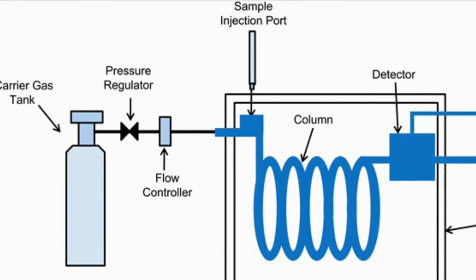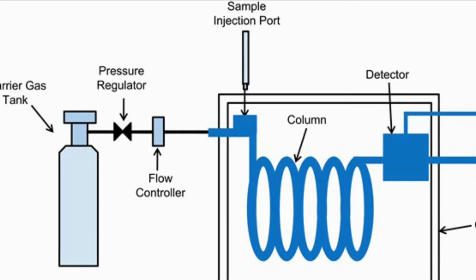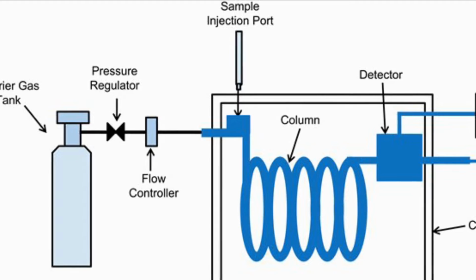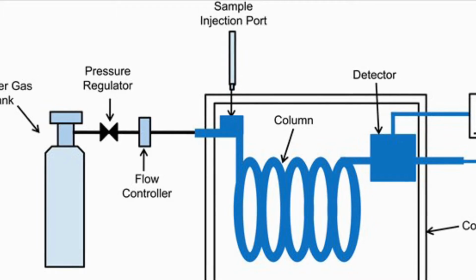This is the first process in gas chromatography mass spectrometry. This is gas chromatography. Gas chromatography is a process that relies heavily on the different affinities of vapor compounds for surfaces. The principles of it are that the mixture is dissolved in a solvent. The compounds are separated approximately by boiling point. The lower the boiling point, the faster the movement, but a lower retention time.